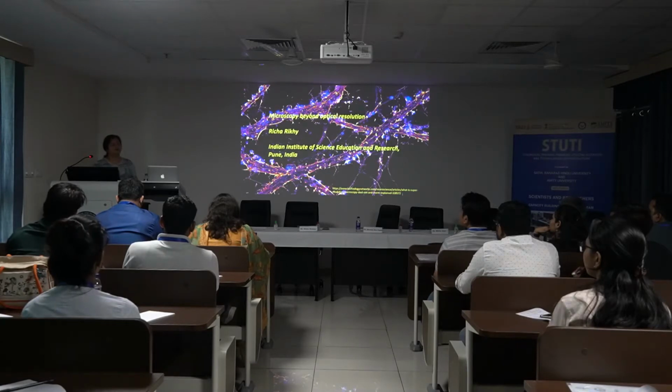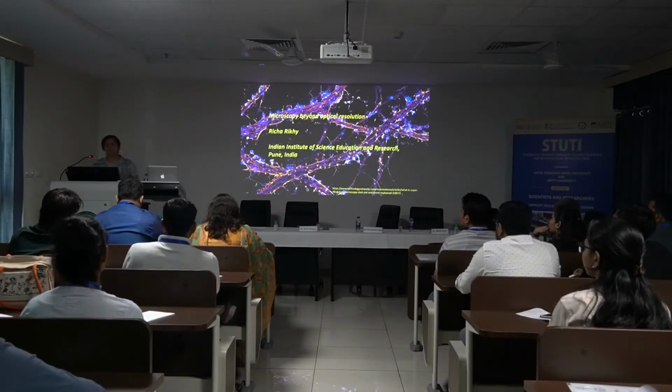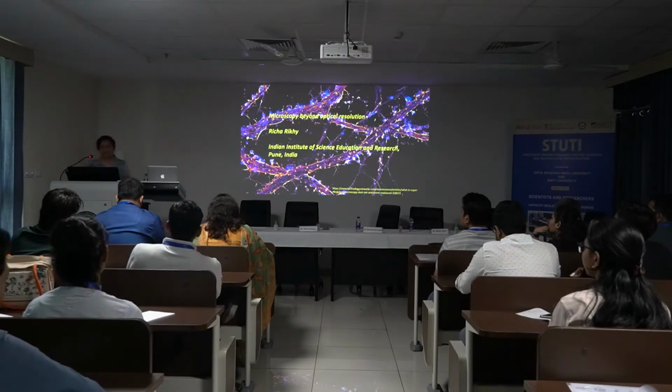We are interested in looking at Drosophila embryos developing, so these are large samples, and we specialize in looking at processes while these cells divide at a high resolution, and then trying to understand what kind of dynamics takes place in these embryos, and maybe some of that will also come out through this talk.